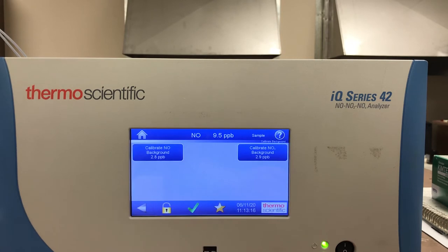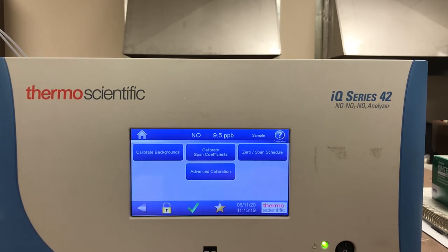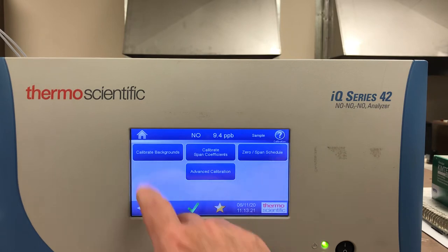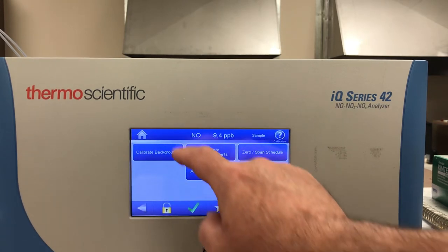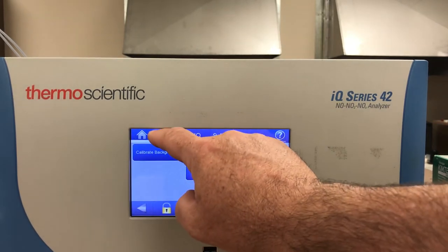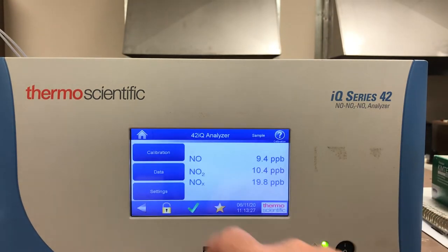So there are some differences right there between just calibrating the i-Q compared to the i-series. If you get lost in the menu system, just press the home button in the top left and it will take you right back to the main screen again.